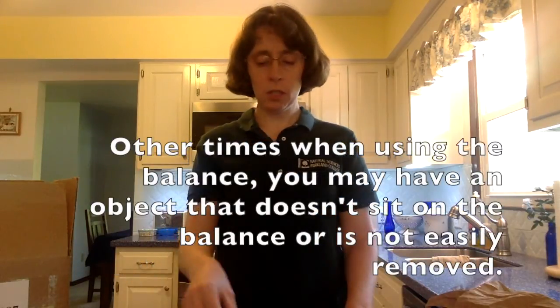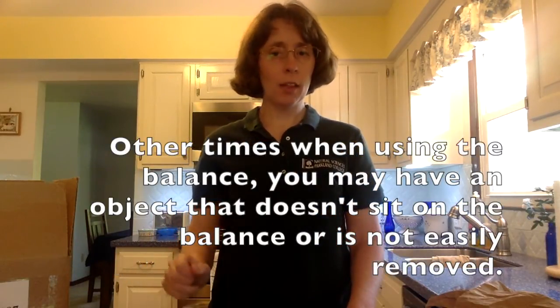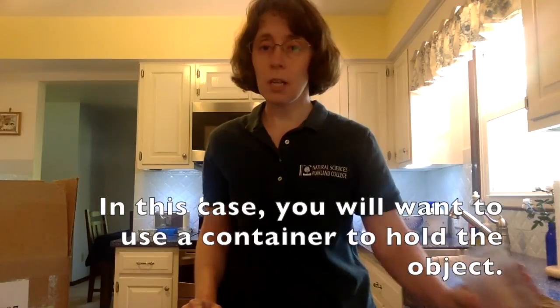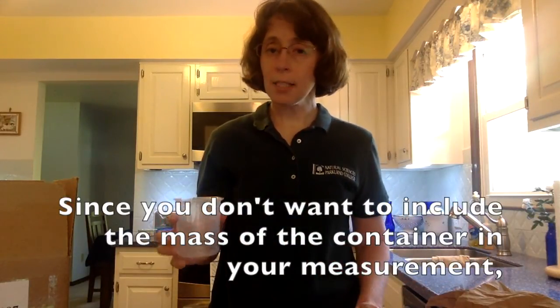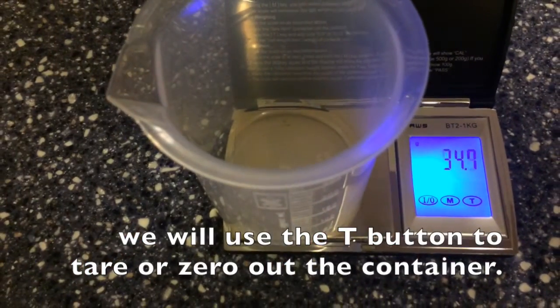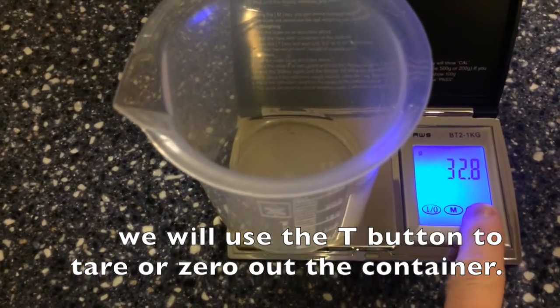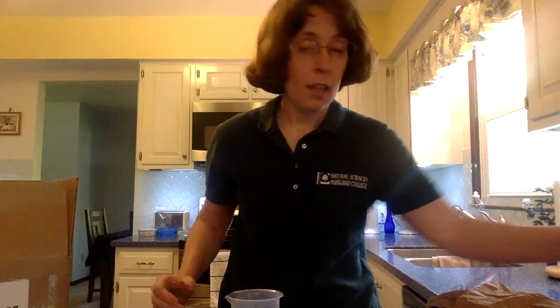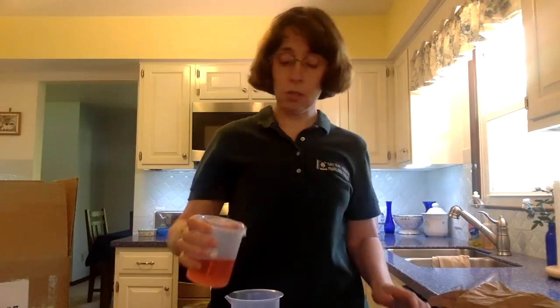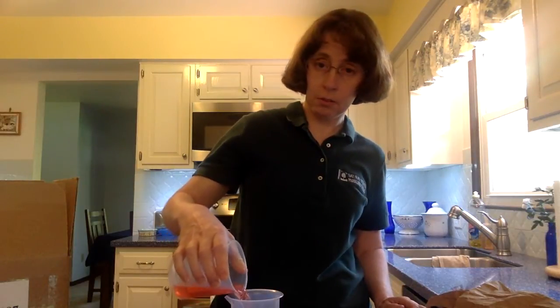Other times when using the balance, you may have an object that doesn't sit on the balance or is not easily removed. In this case, you will want to use a container to hold the object. Since you don't want to include the mass of the container in your measurement, we will use the T button to tare or zero out the container. Then add any solid or liquid object to the zeroed out container.